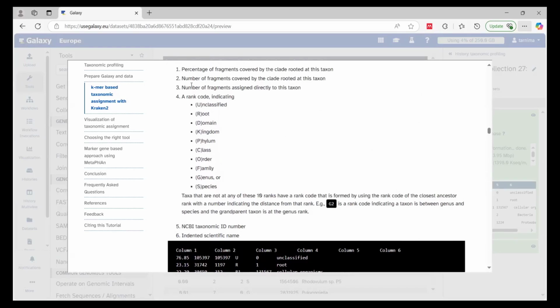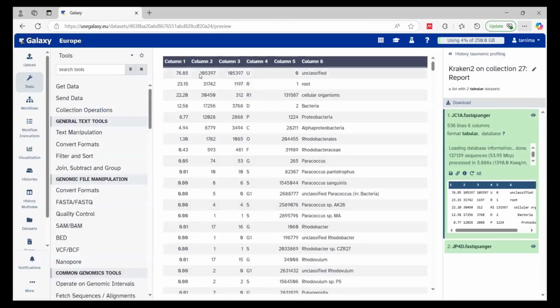Then the second column, we can see it clearly from here. The second column, column 2, is just the total reads, the count for this group. For example, the count for bacteria and all its subgroups is 17256. This is the total reads which are classified as bacteria.